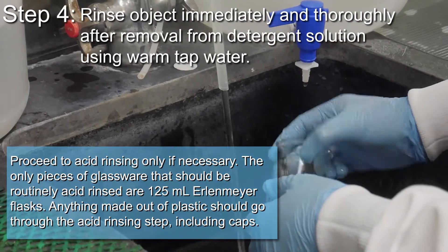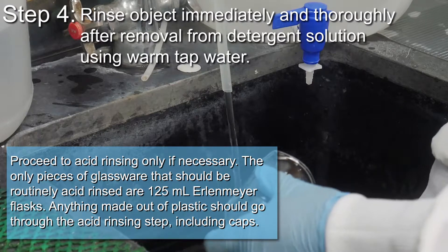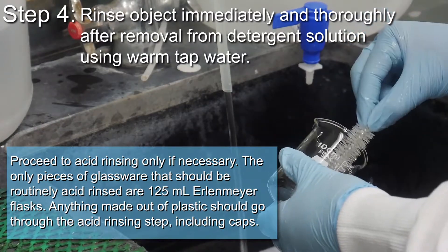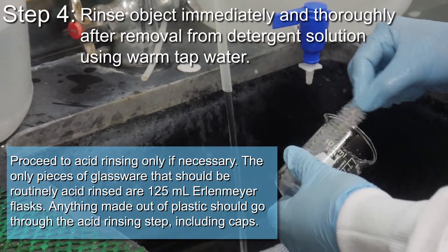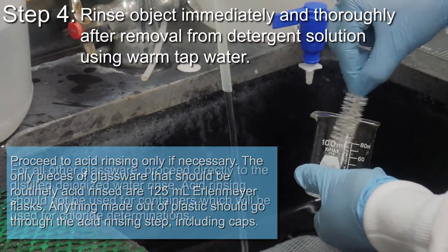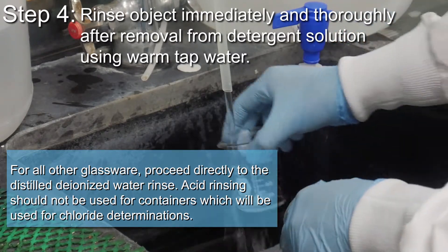The only pieces of glassware that should be routinely acid rinsed are the 125 ml Erlenmeyer flasks. Anything made out of plastic should go through the acid rinsing step, including caps. For all other glassware, proceed directly to the distilled deionized water rinse.